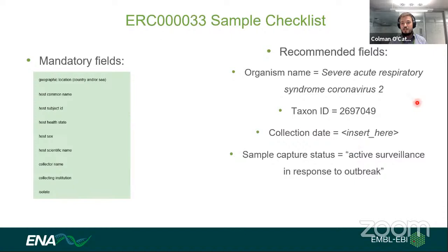You'll be able to drop down to that specific wording. So yes, that is the principle behind that sample checklist. If you do want to know more about sample checklists, they're used to make the metadata very searchable and much more organized, which you'll see why that's really important in a little while.